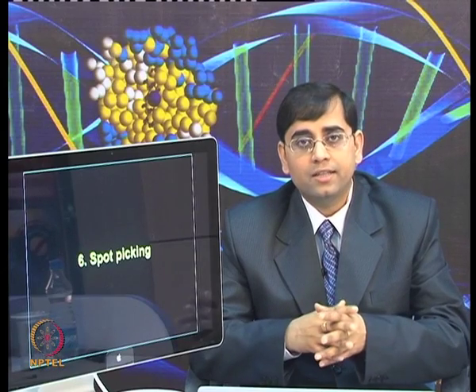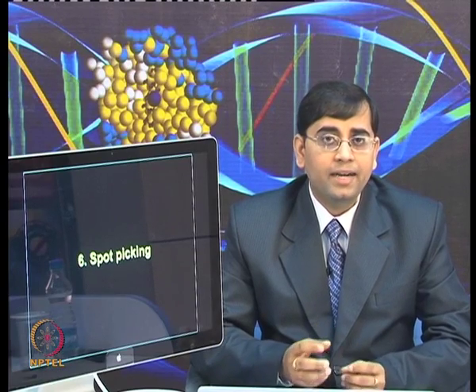Many times people want to know the global expression of all the proteins, for example, for a given organism whose proteome is unknown, and you are the first one who wants to characterize and identify all the proteins from that sample. So, you would like to know what proteins are present in that sample. In that case, you would like to identify all the proteins present on your gel. So, you need to do mass spectrometry for each of those protein spots. That is not possible to do manually, so in that case you have to rely on spot pickers.